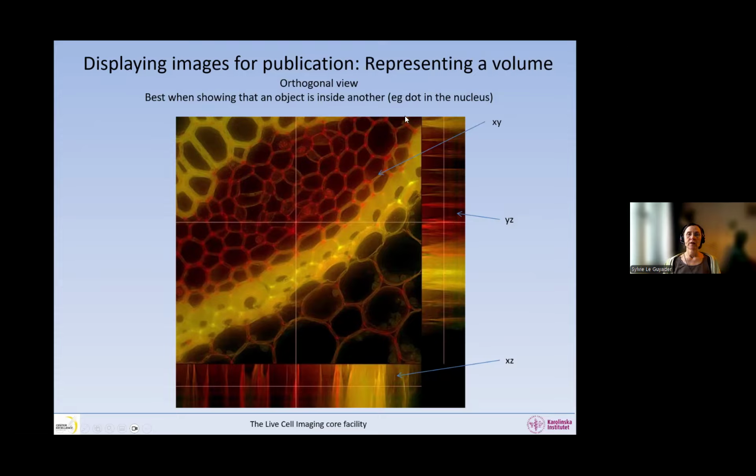One of the classic ways of representing a volume is the orthogonal view. And it is really best when you want to show that an object is inside another. So in this image here, the center part of the image, we are representing an XY view. So this is a plane, basically, in your Z stack. So one plane of your Z stack.